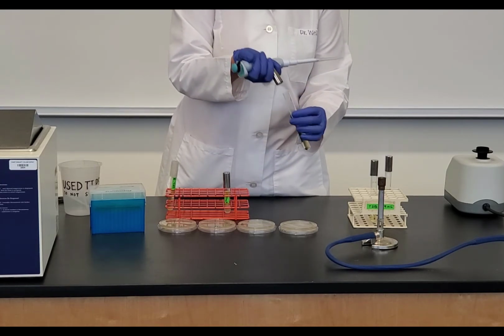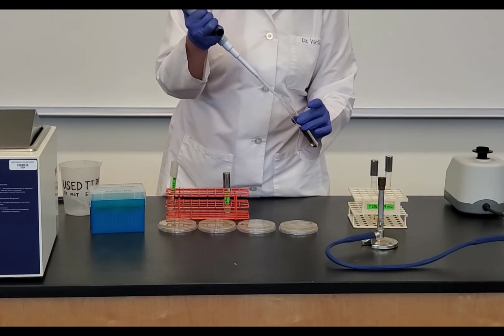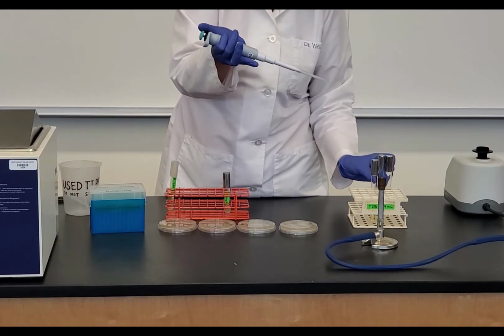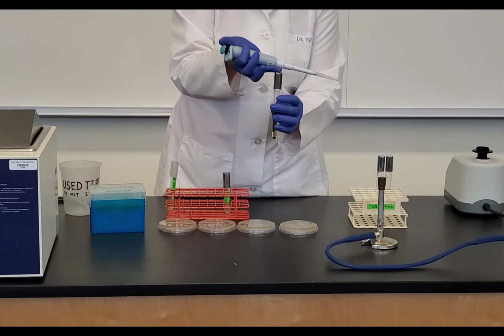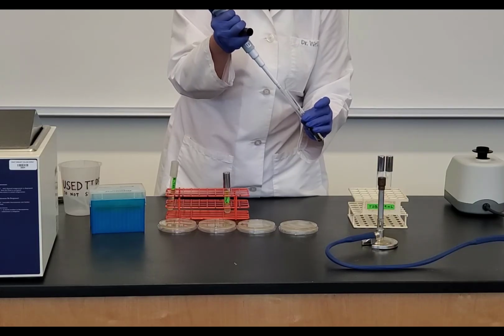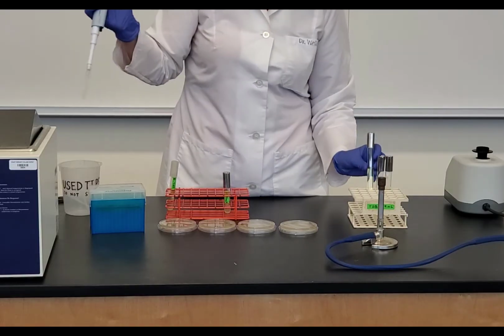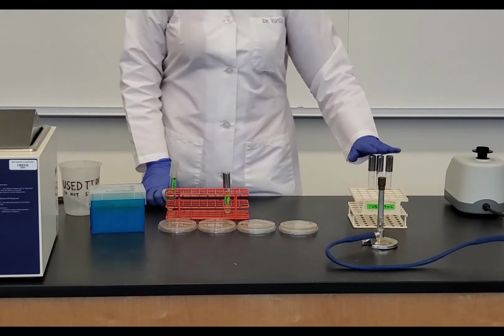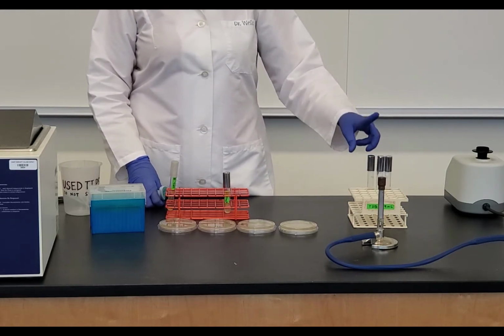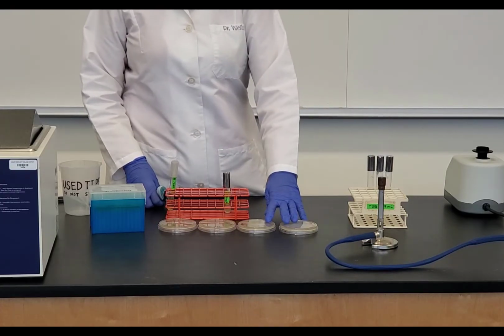So cap between my pinky and ring finger, flame the opening, draw up 100 microliters, flame it, recap. I'm done with this one. I'm adding it to my 10 to the negative 6. Take the cap off, flame the opening, add it, push to the second stop, flame it, cap, and get rid of my tip. So now I have my 3 serial dilutions. I have my 10 to the negative 2, 10 to the negative 4, 10 to the negative 6, and so now I'm ready to use these on my plate.